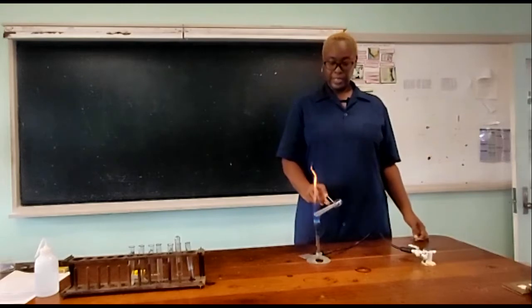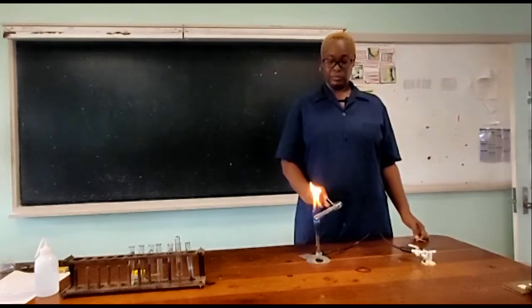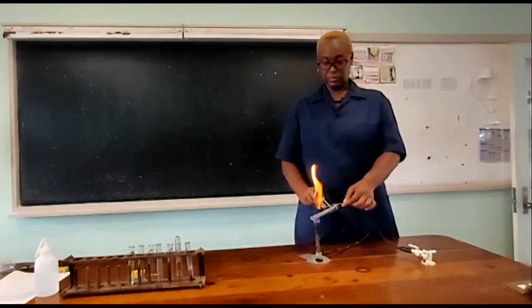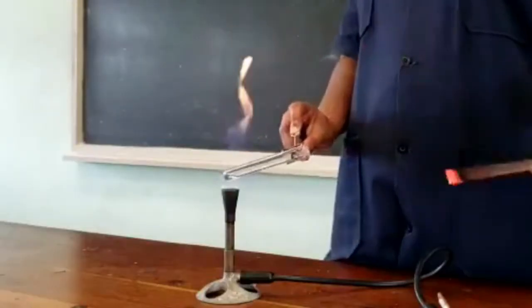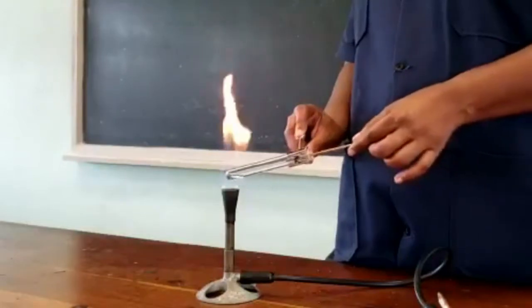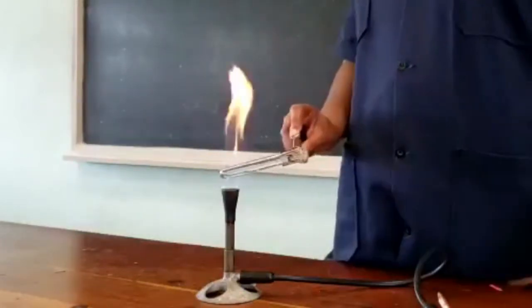So we're still heating. Let's see what happens with my splint, still nothing happens with my splint, but we continue to heat.